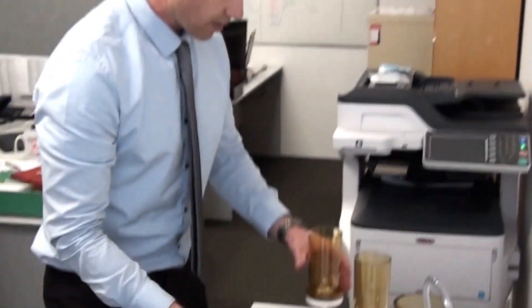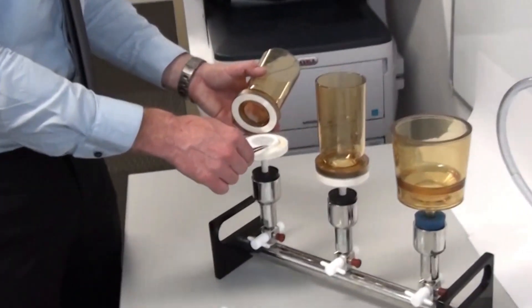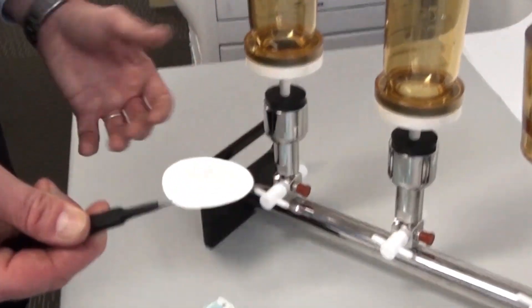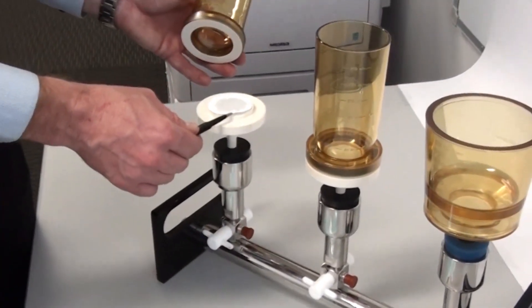And in your typical setup in a micro lab, you'd filter your sample through, you'd grab your 47 mil membrane, and you'd pop that on an agar plate for incubation. Looking for bacteria.